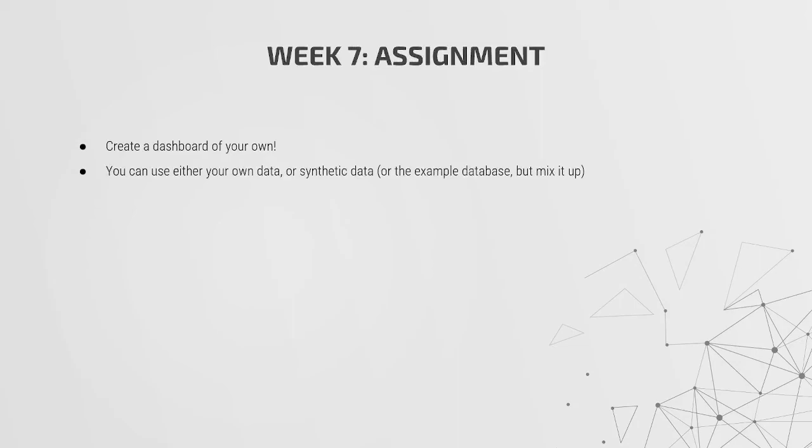So for this week's assignment, we want you to create a dashboard of your own. You can either use your own data or synthetic data using that script that takes a session and just replicates it over time, or you can use the example database. But if you do, don't just recreate the database that I've done, because I'll provide that script for you as well. Make it your own and make it what you think would be useful to you to see.